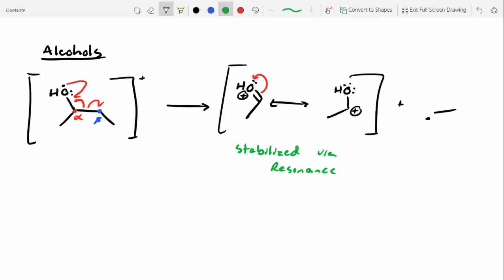Those are really easy to dislodge. Breaking a pi bond, they are weaker than sigma bonds, so I would guess that you could do that if that's an available option. We'll see some examples. It makes a lot more sense when you're analyzing mass fragments just to cut up individual bonds, and then if you see an alcohol, remember, hey, we can cut this alpha-beta bond and get a really stable fragment out of that. So let's take a look at another one.